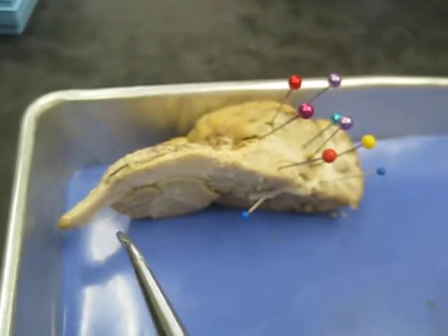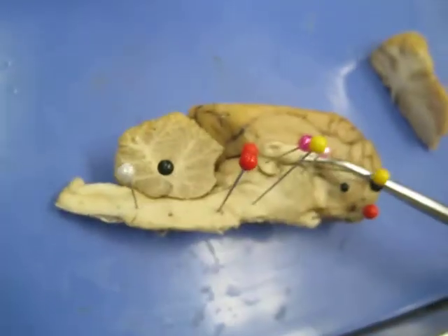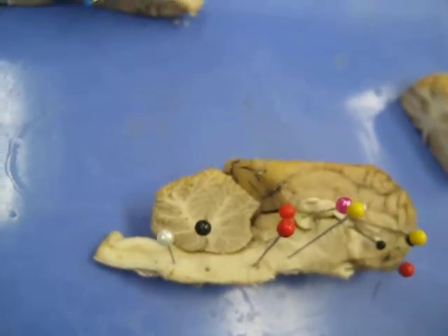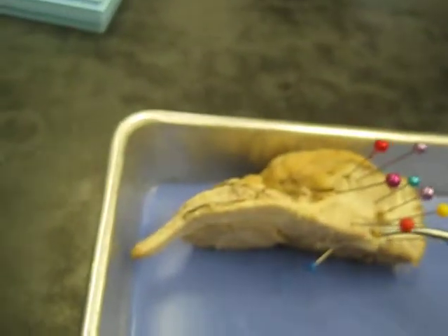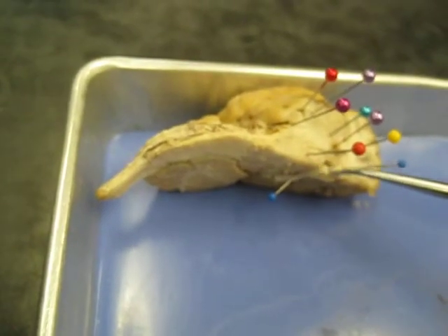Yeah. Yes. Do you? One is the membrane. So this right here, remember this is the racetrack, right? The top part of the racetrack is the corpus callosum and the bottom part is the fornix. So right now you're looking at it upside down. So you have the corpus callosum on this side and the fornix on this side.